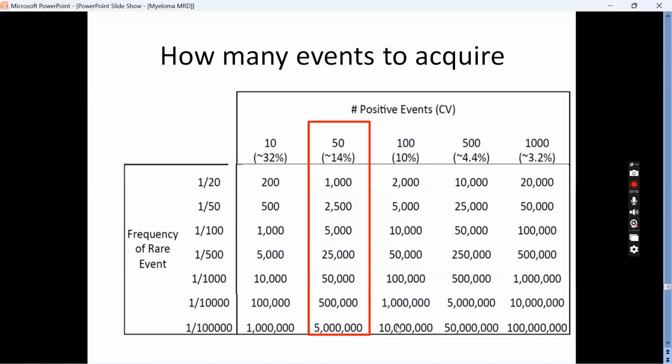You need to acquire 10 million events. Still, you are a beginner and you say, no, even 100, I'm not confident. I need a good chunky cluster, something very similar to a diagnostic. Then if you keep that cutoff as 500 events, those 500 events should show the abnormal myeloma associated phenotype and should be kappa or lambda restricted.